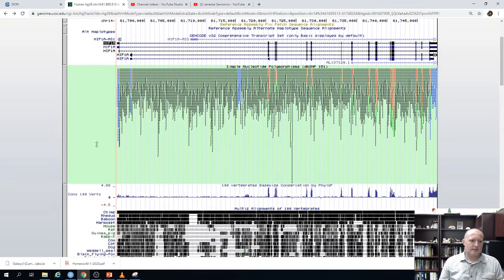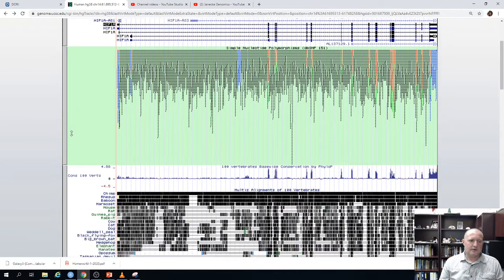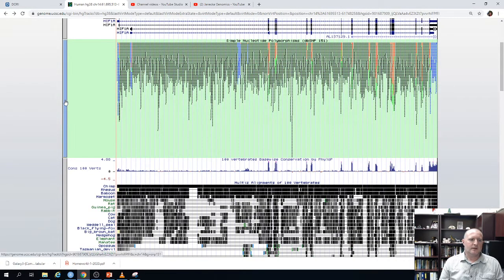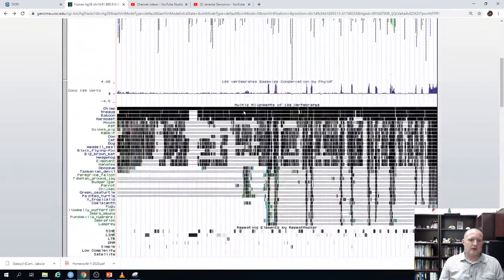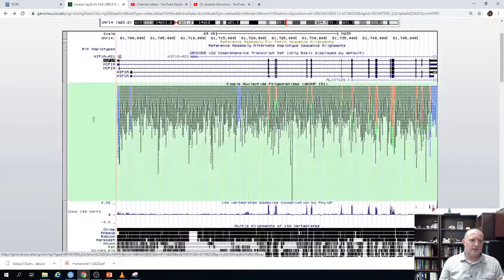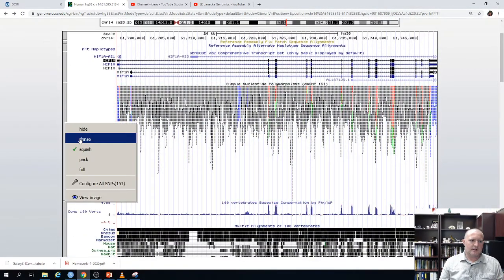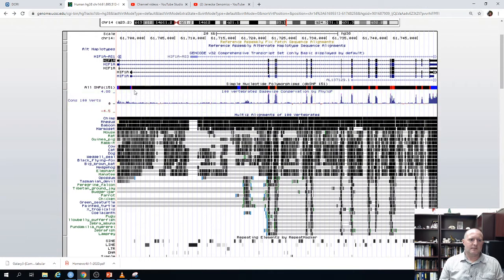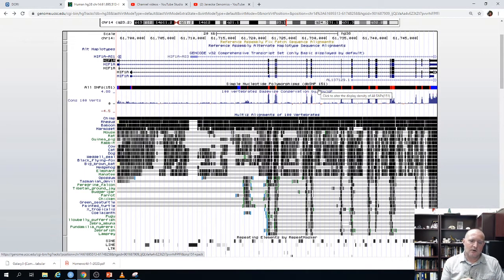These tracks can be reordered, collapsed, or expanded. For example, if we want a better overview of all the tracks, we can collapse the SNP track into what's called a dense pattern. This collapses all those variants into a single bar so you can now see how the non-synonymous SNPs perfectly overlap with those exons.